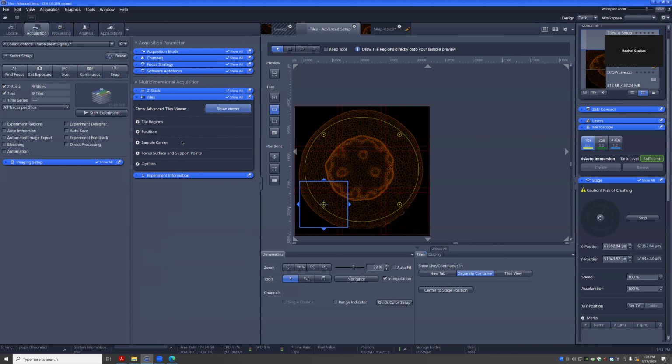But yeah. One question: for the old one, you don't have the flexibility. So with this one, I can see when you draw the area you want, it automatically calculates that you need, for example, a 9-tile. But before, I had to set up a stick myself and then see how many. So is this how they calculate it, based on the resolution or something?